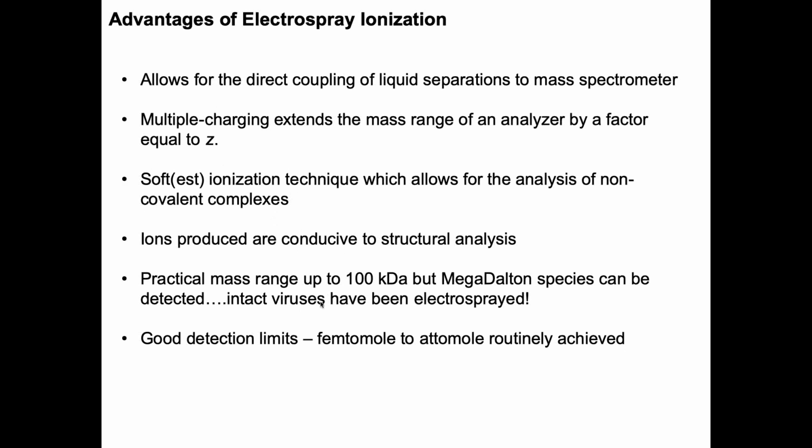She has figured out how to modify mass specs and electrospray these enormous multi-protein complexes, and start picking apart structural information, so you can envision having a protein complex and a drug that you want to look at how it disrupts that complex. There's a lot of things you can start to do with that type of technology, and that's the cutting edge. And so you're talking megadalton complexes with non-covalent interactions, really, really high-level stuff.